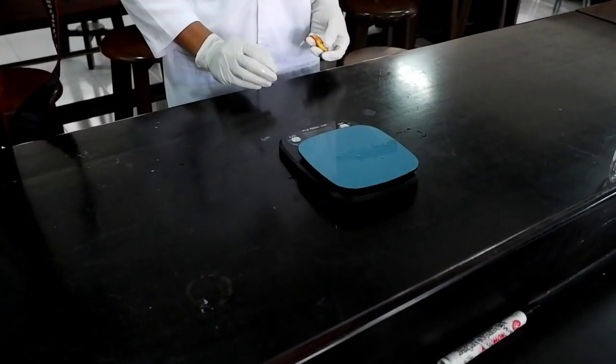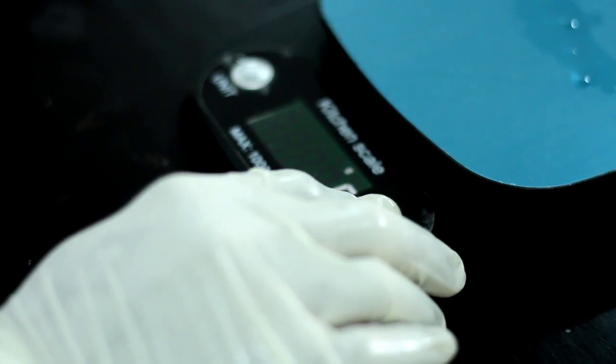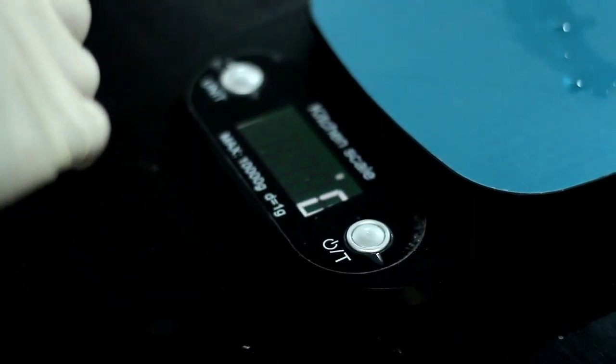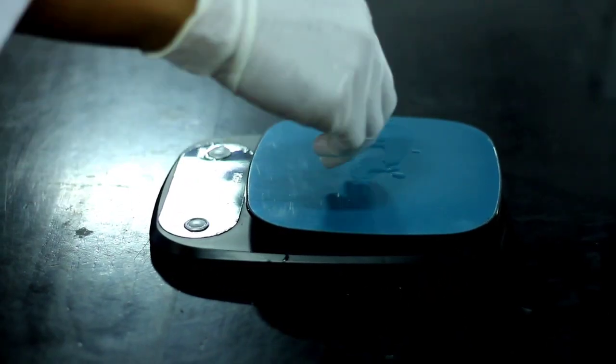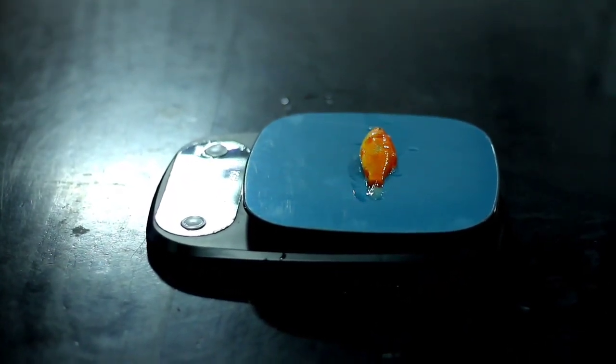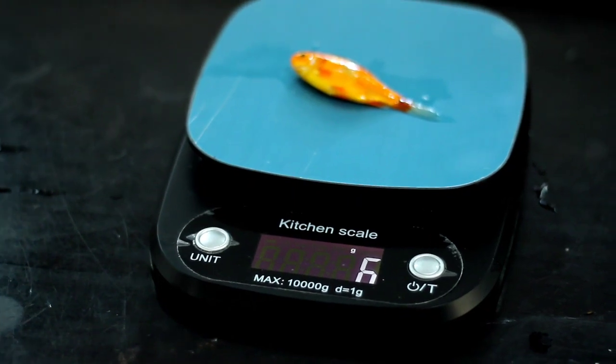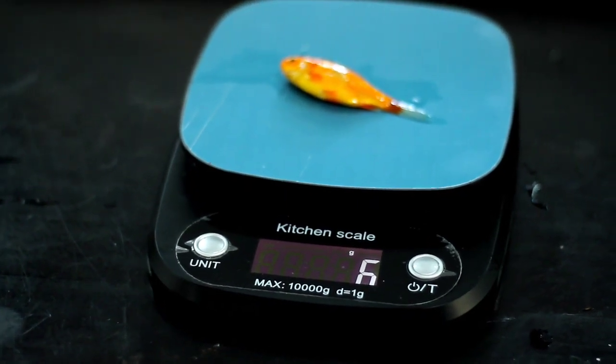The first step is to measure the weight of the fish with the digital scale. I choose four fish that have the same weight, which is six grams.